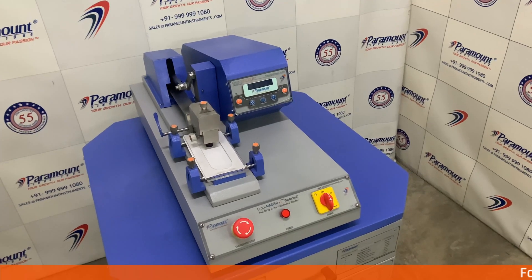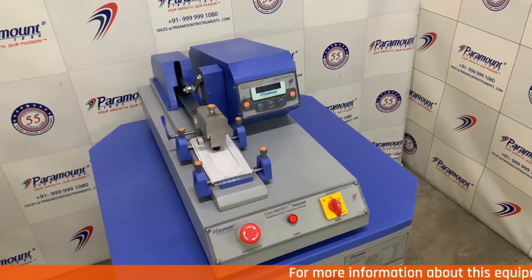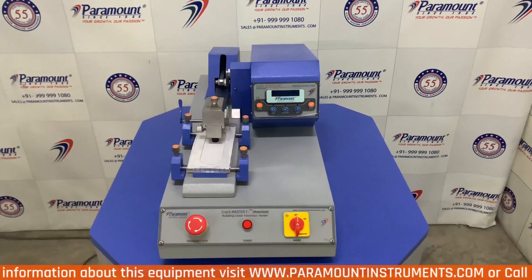Hi, my name is Grace. Today, let me explain how to use Paramount's CrocMeter i9 Digital. This is a special equipment which comes with our exclusive lifetime buy-back warranty.